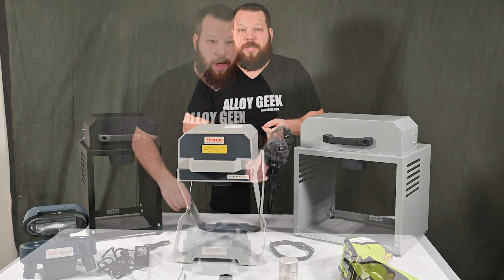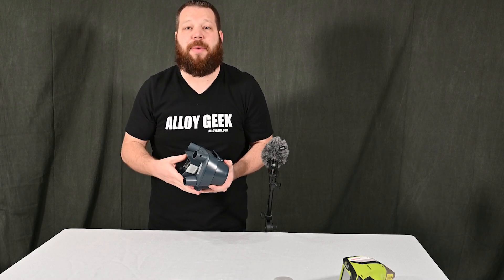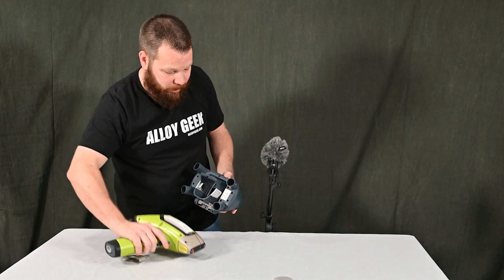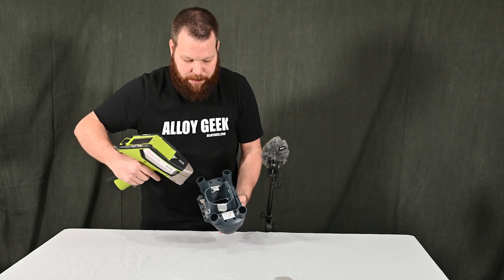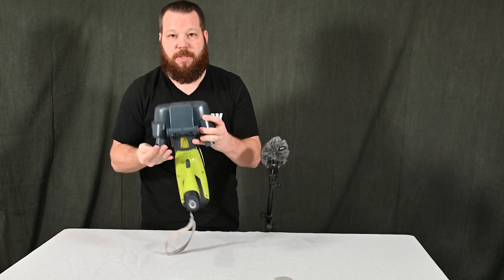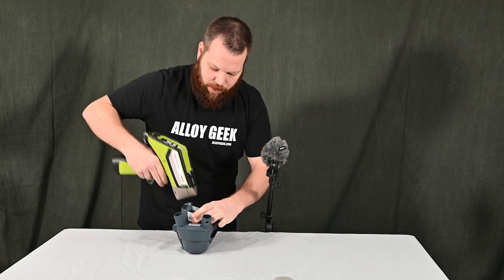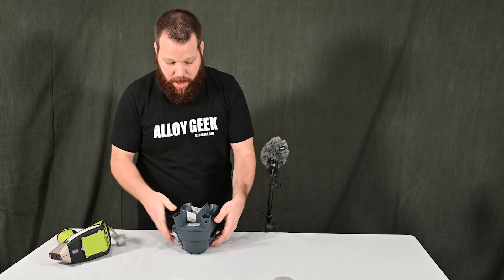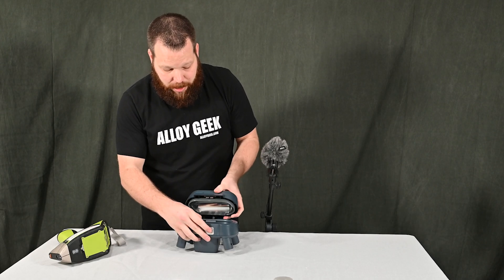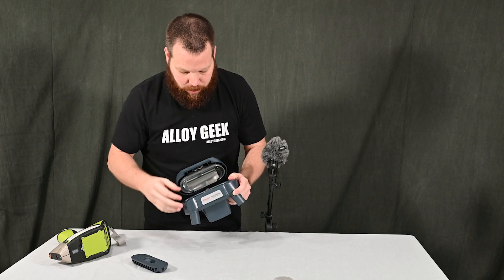First up, let's take a look at this mobile test stand — this little blue box. Normally this has legs coming out of it. Both the Niton XL2 and XL3T simply clip into the bottom — there's a flat face on top of your XRF and it just clips in, and the legs suspend your XRF in the air, turning it into a little benchtop. This is a test stand I don't typically recommend because the sample stage is very small — about an inch across — and that's pretty small.